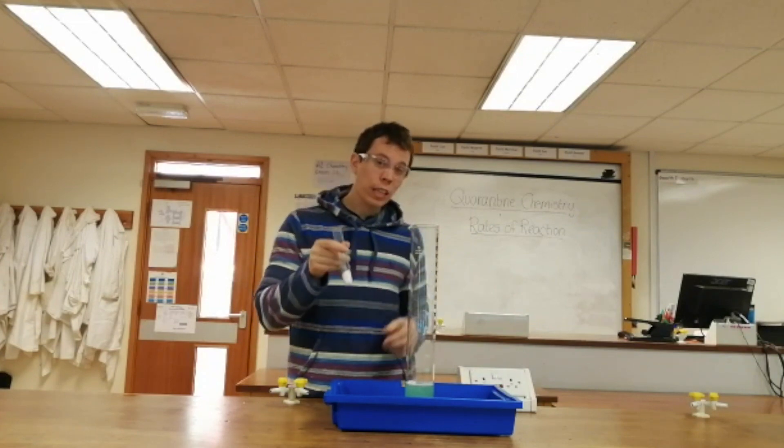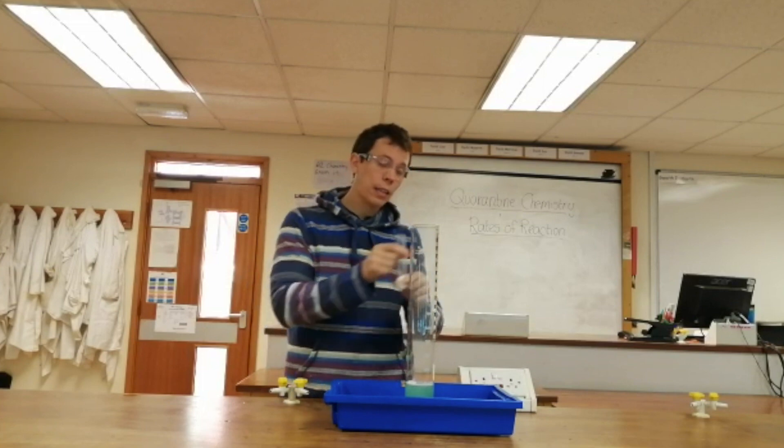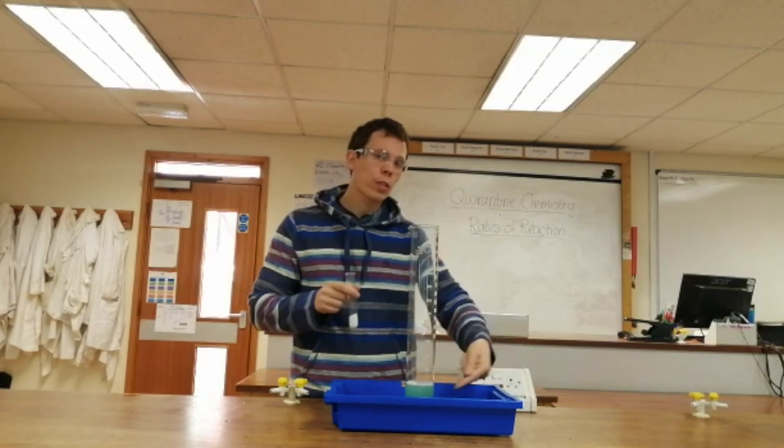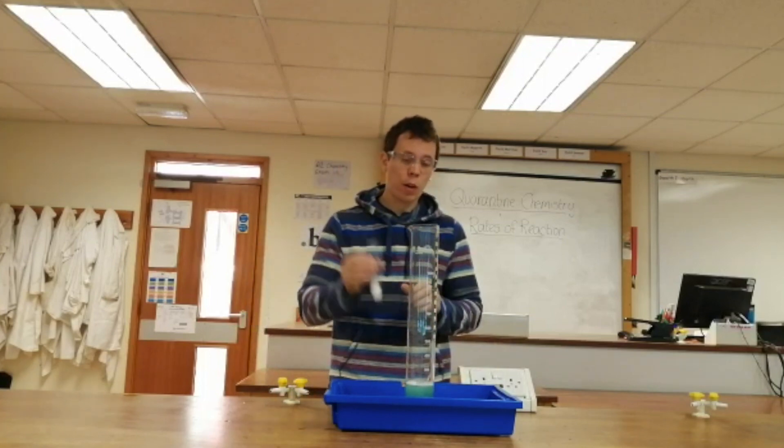We're going to try and speed that up by adding our catalyst. The catalyst is not going to get used up in the reaction. The same amount of catalyst will be here at the start as there is at the end, but it's going to encourage this reaction to proceed faster. So I'll pop this in, stand out of the way, and we'll see what happens.